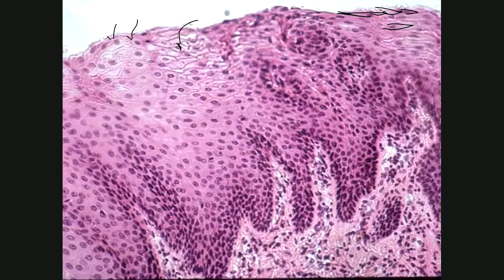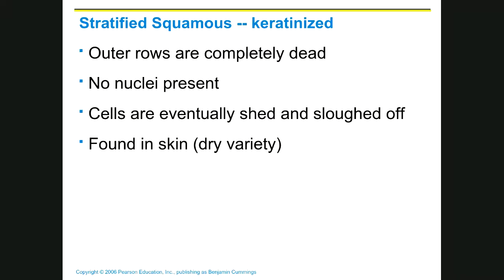And look how thick this is. So you can see how it would be protective. It's thick. It's like wearing a thick coat versus a thin shirt. It's protective. Let's look at the keratinized version.